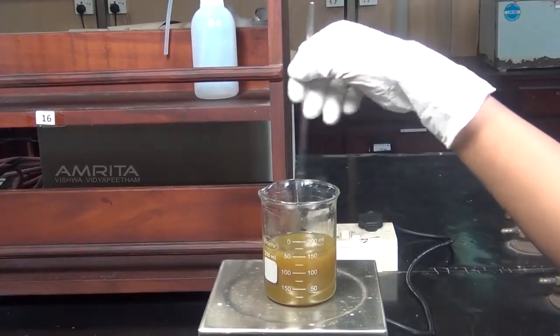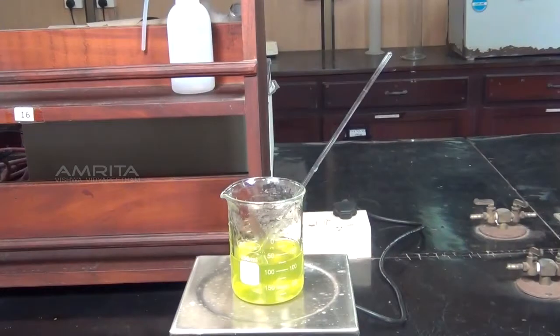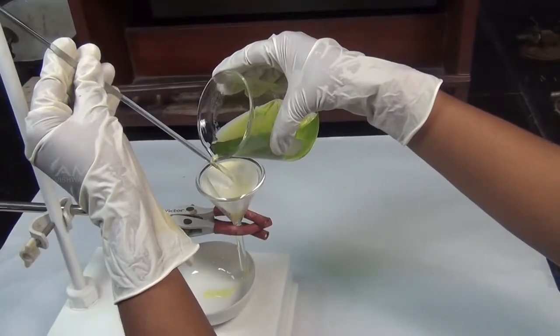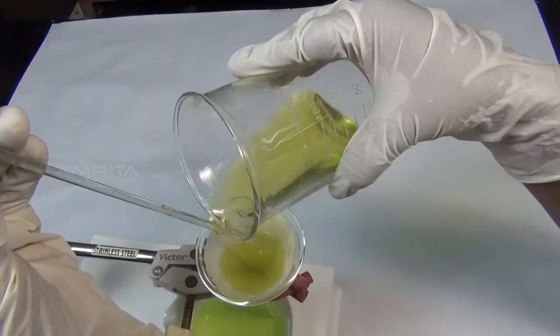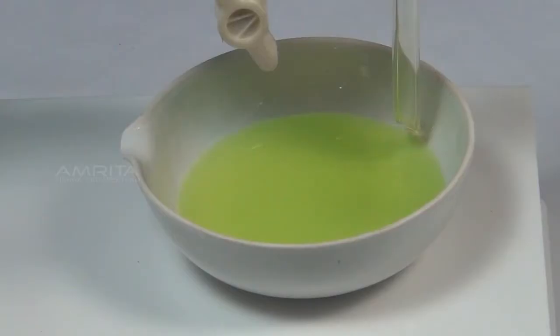If the precipitate does not dissolve, then warm it and leave the contents for some time. Then filter the solution into a china dish using a funnel and filter paper. The stem of the funnel should touch the wall of the china dish to avoid the solution splashing out.